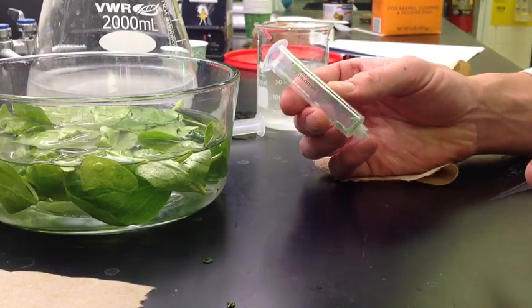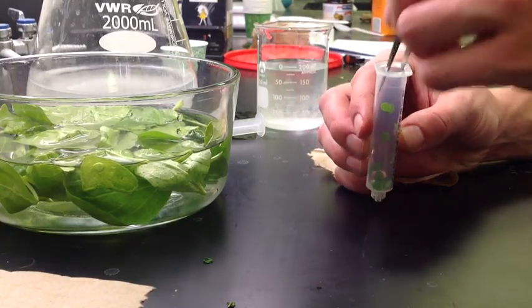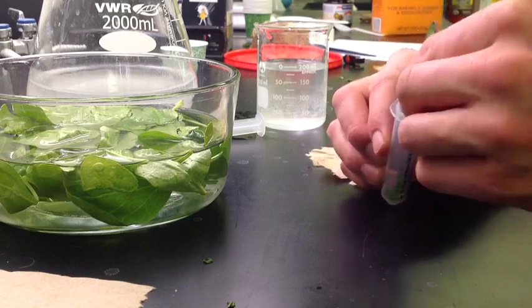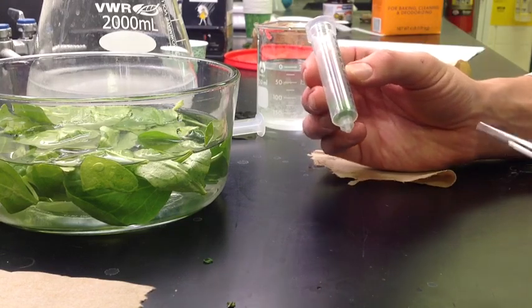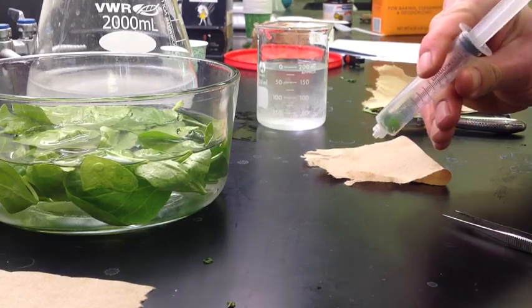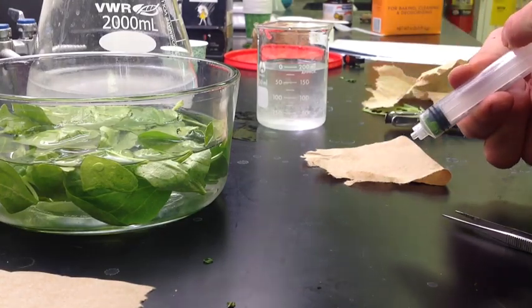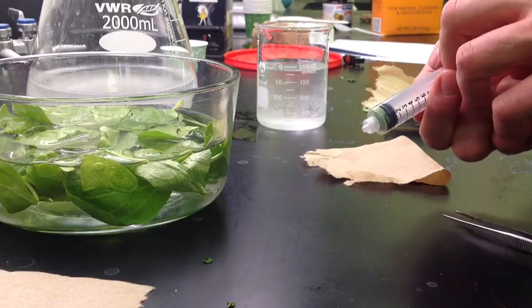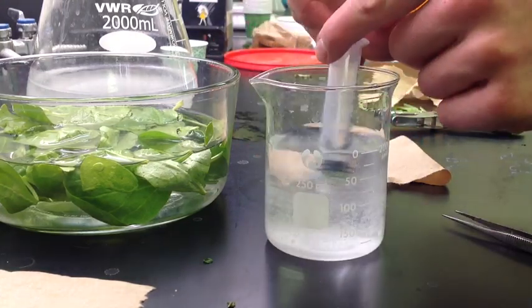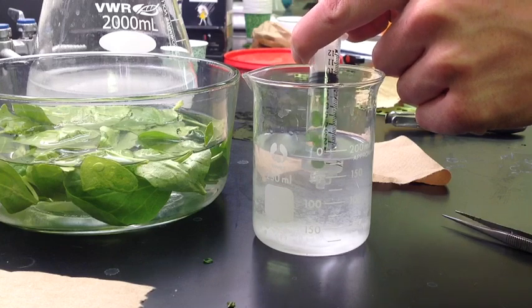Once I have all of my discs inside my syringe, I am going to use forceps to push them down as far to the bottom as they can go. Then I will add my plunger, push it nearly to the bottom, and suck up 10cc of my baking soda solution.